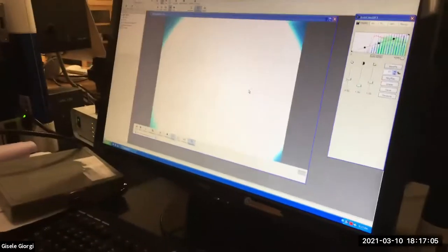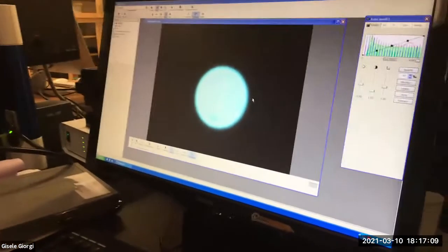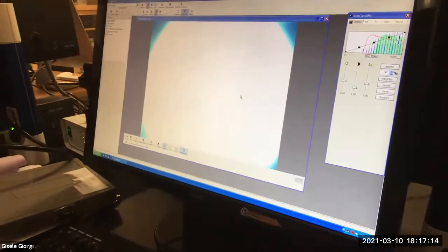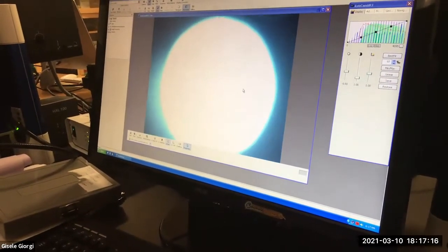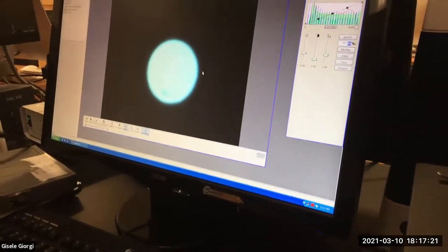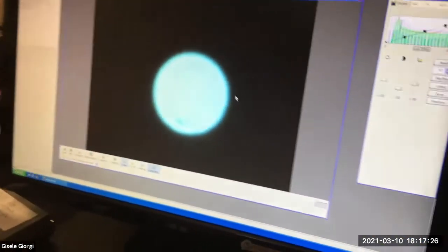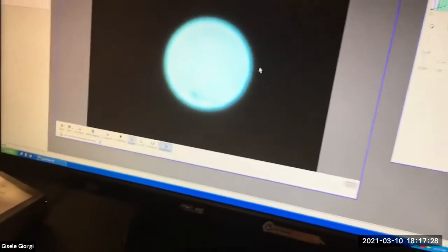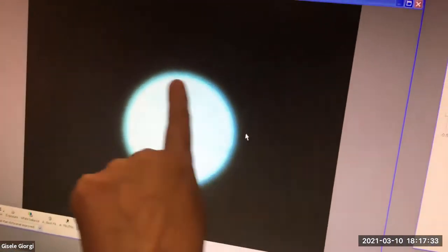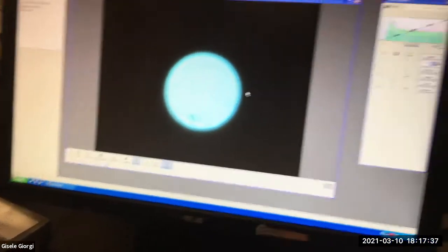There's basically a round diaphragm that I'm controlling. I'm making it all the way open actually, and then all the way closed. I can already tell the scope's in trouble because it should go more wide and go smaller. And you'll see it do that in a sec when I actually fix it. But one of the things I want you to notice is, what you're looking at right now is the iris, the light coming through the field stop.